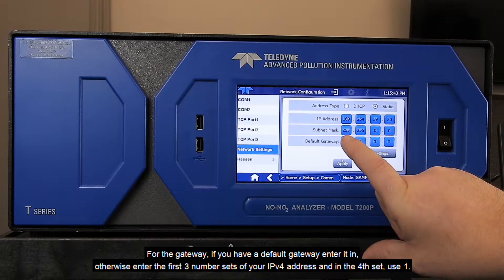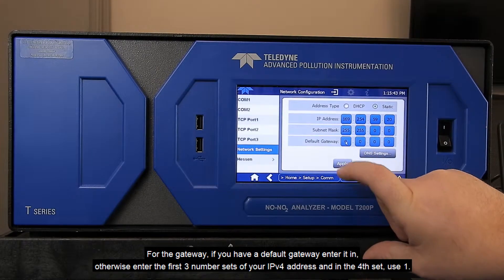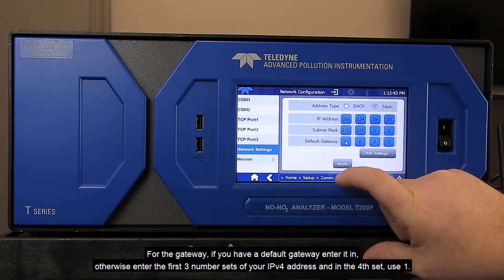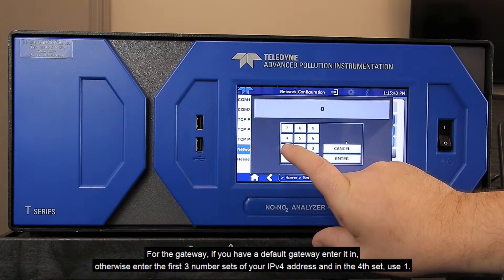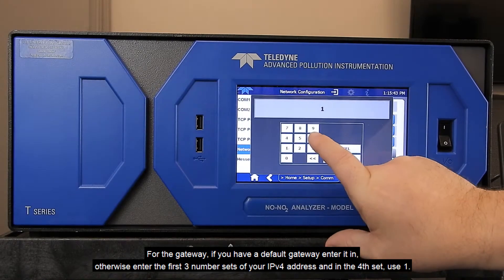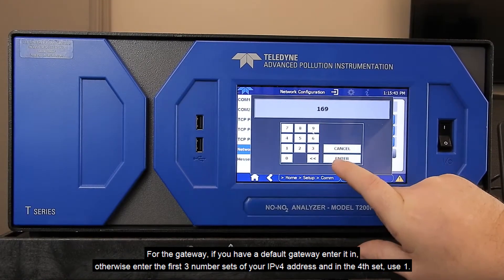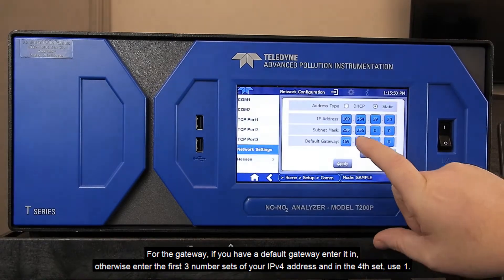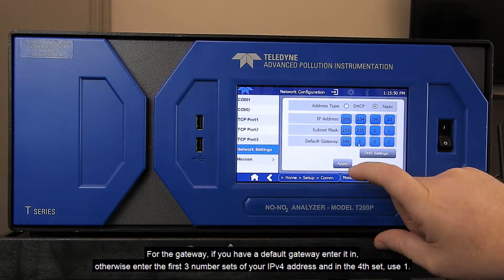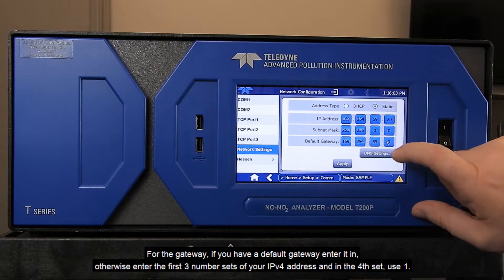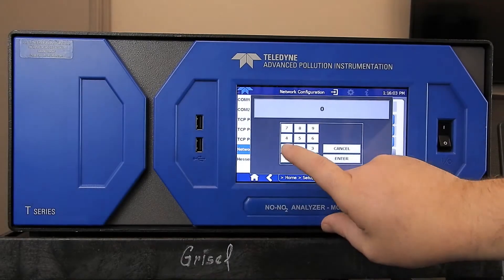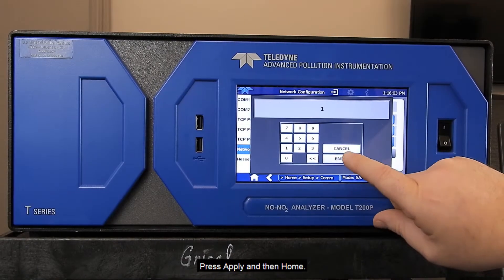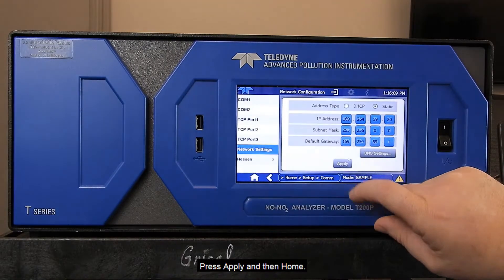For the gateway, if you have a default gateway, enter it in. Otherwise, enter the first three number sets of your IPv4 address and for the fourth set, use the number one. Press Apply and then Home.